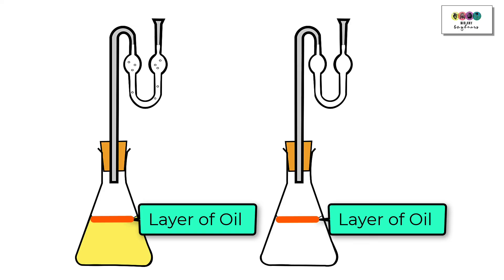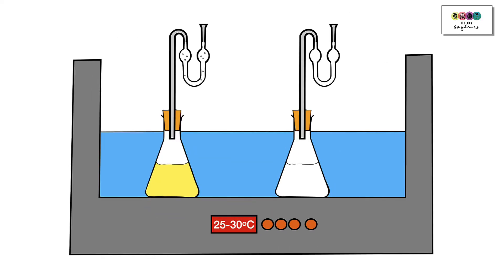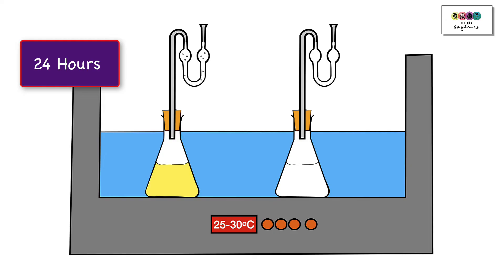In some books you'll see that a layer of oil is also added to both vessels to maintain anaerobic conditions, but this is optional and not necessary because the fermentation lock is already doing that. When everything is set up, transfer both vessels into a water bath set between 25 and 30 degrees Celsius, or into an incubator, and leave for 24 hours.